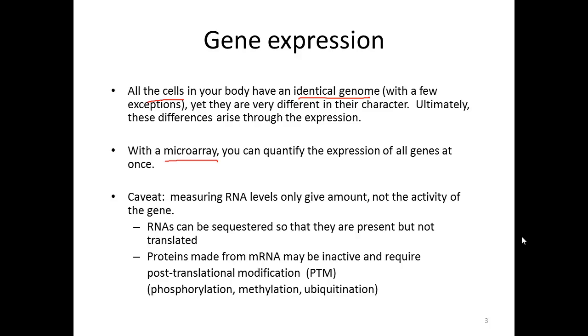So while we can't guarantee that knowing the RNA level will give us insight into all the things going on in the cell at that instant, because it's such a useful technique, so robust and giving us a truly global picture, microarrays really were a major breakthrough in the analysis of cell activity.